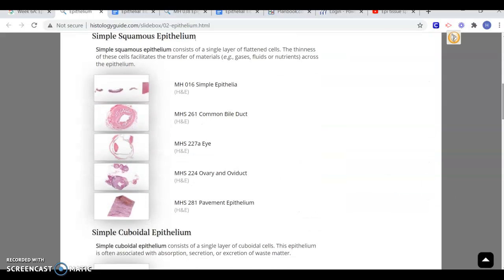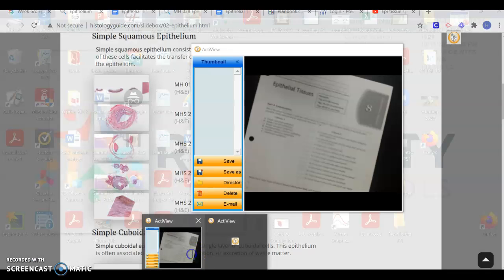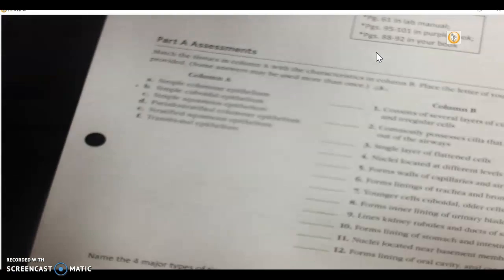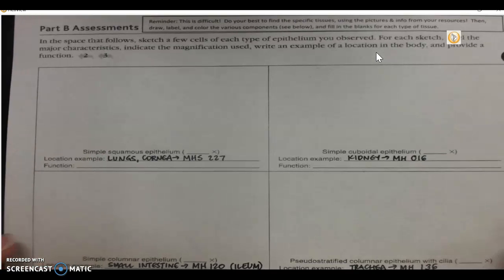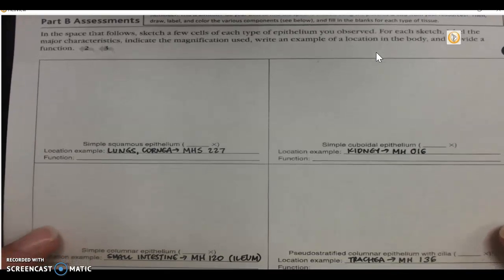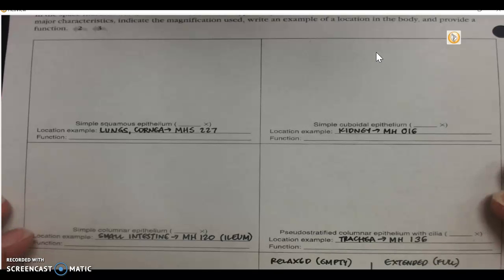One thing I wanted to show before we go any further is we did record some things on our paper. I was just going to put this up here so you guys could see, and I also will attach a picture on Canvas. It's a little bit blurry right now, but this is explaining the types of tissue that we most often think of containing these types of epithelial tissue, or the ones specifically that we're going to look at with the website.